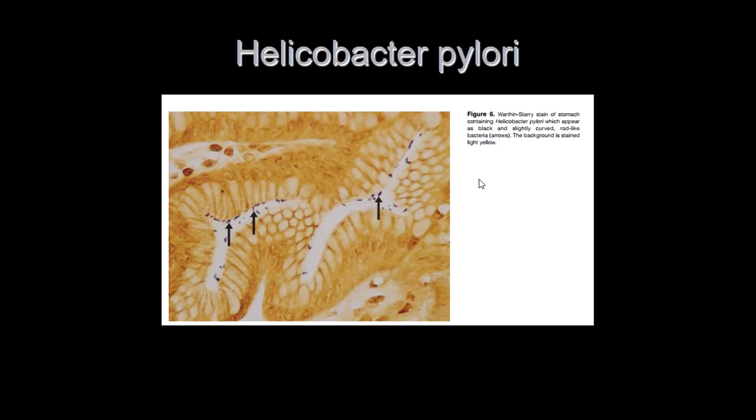So the Helicobacter pylori, if you take that from the stomach, you can see them slightly curved here, so they differ from the rest of the bacteria. And the key point in their differentiation is the urease enzyme, which changes the pH here of the stomach that makes them grow.